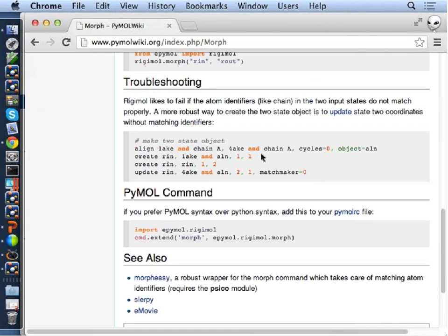It shouldn't be your boundary, because you showed two structures, right? The boundaries for the two structures were exactly the same, or there was some missing part in one structure? Yeah, so that's exactly the same. I mean, you're moving an atom, so it must be there in the beginning and in the end. That's obvious, yeah? Come on, you can repeat the question.